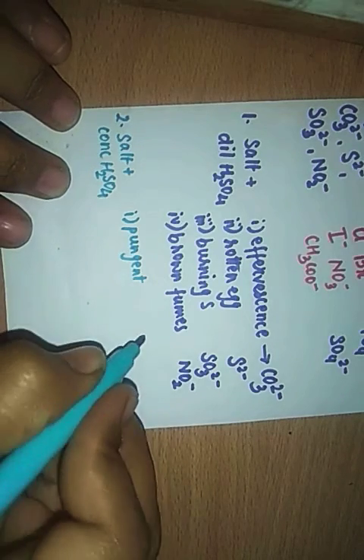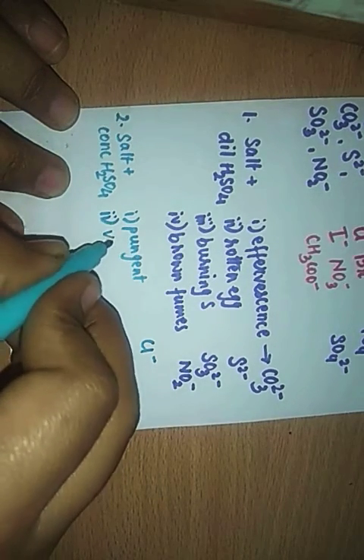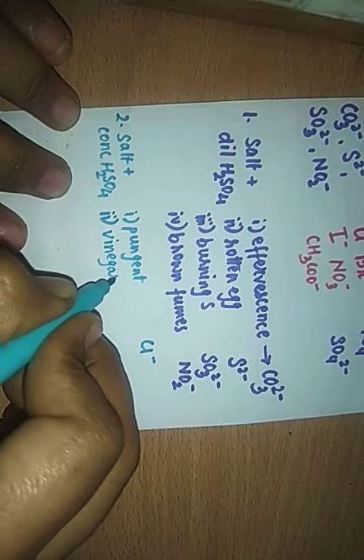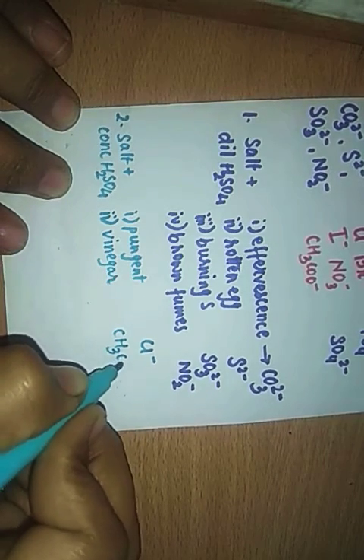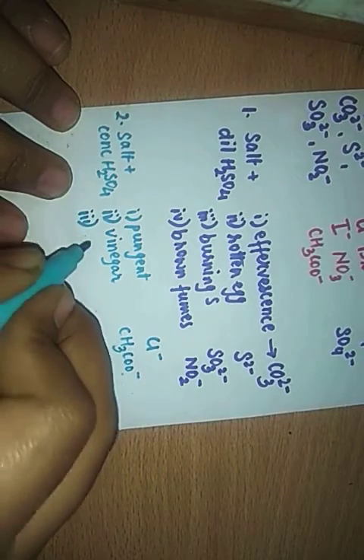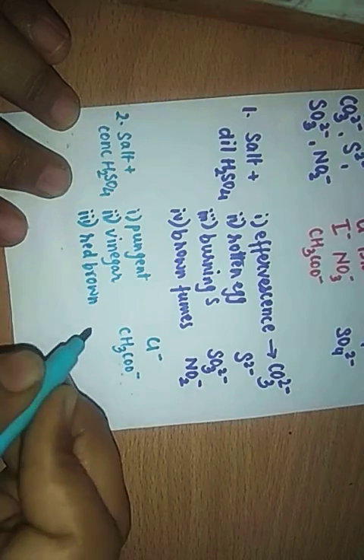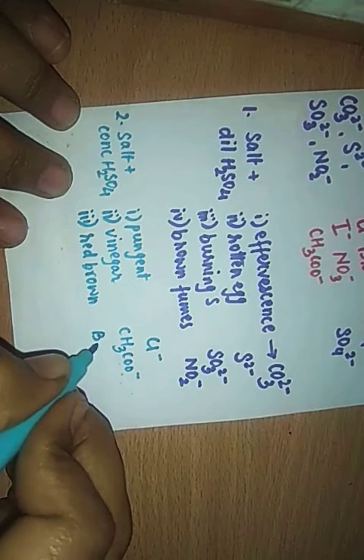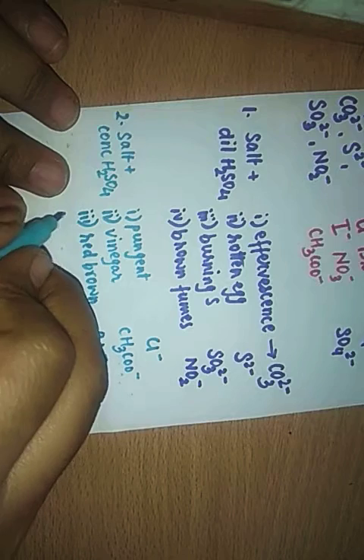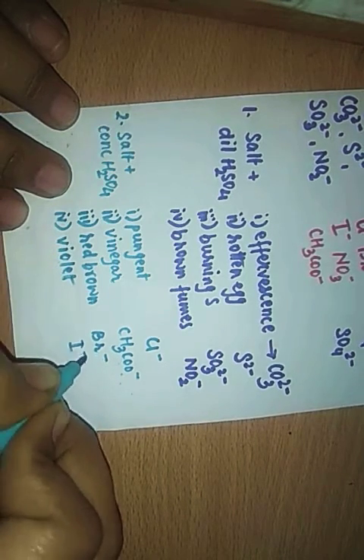If white fumes are coming, then we confirm it is chloride, right? If it has a vinegar like smell, then it may have acetate ion. If it has a red brown gas with a suffocating smell, then it may have bromide ion. If it has a violet colored gas, then it may have iodide ion.